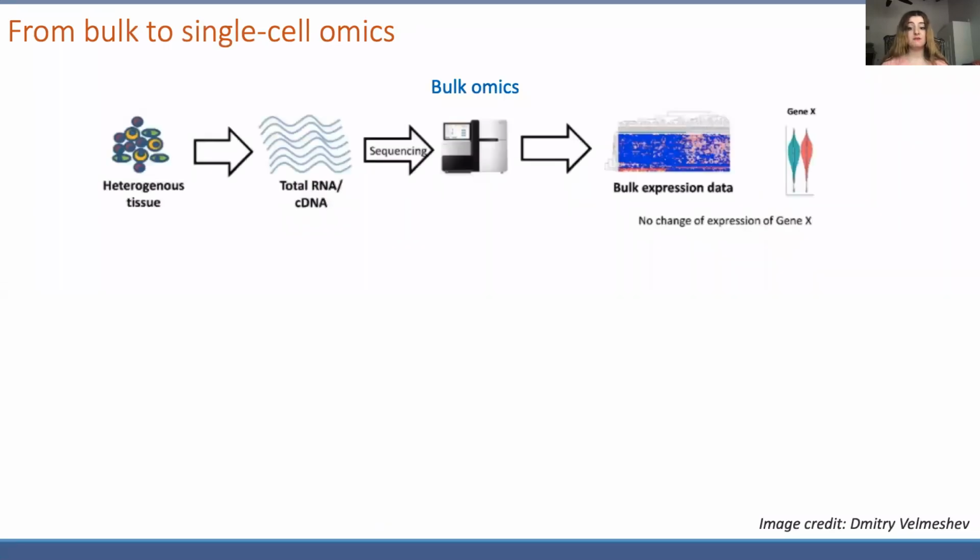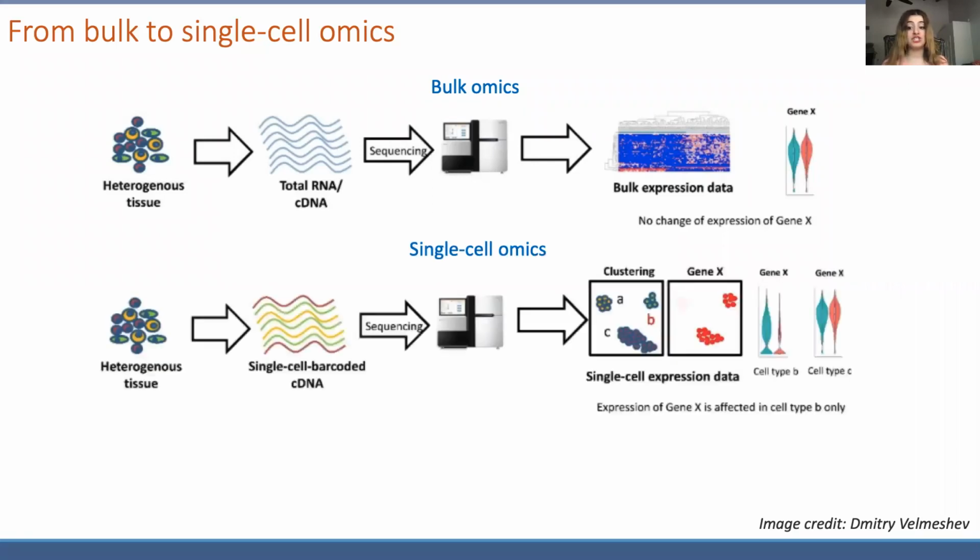In the context of the omics, bulk omics analysis that use average data across a bulk population of cells, although valuable, fails to reveal important biological phenomena. However, analysis of the genomes, transcriptomes, and proteomes of single cells in the context of their spatial information can reveal a wealth of information: tissue heterogeneity, spatial organization, gene expression and dynamics, and disease pathogenesis.